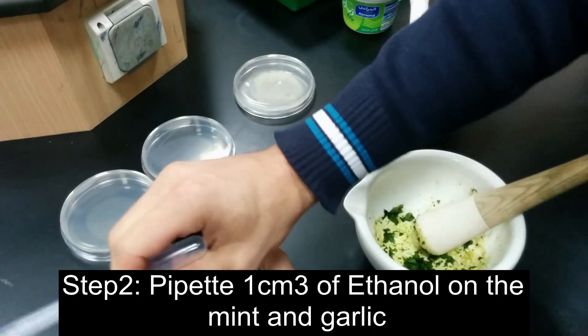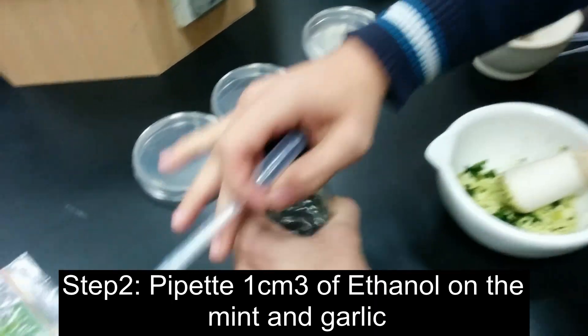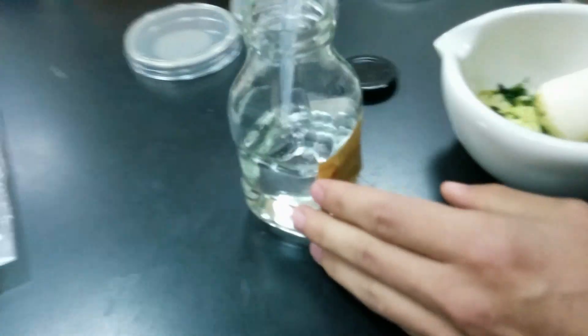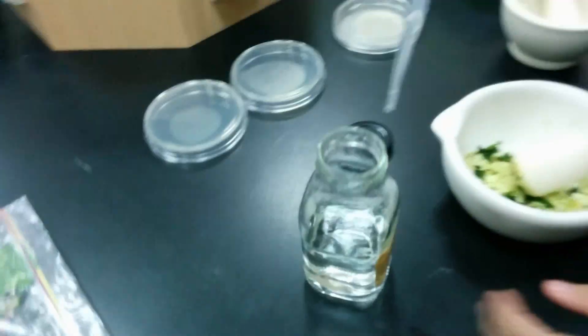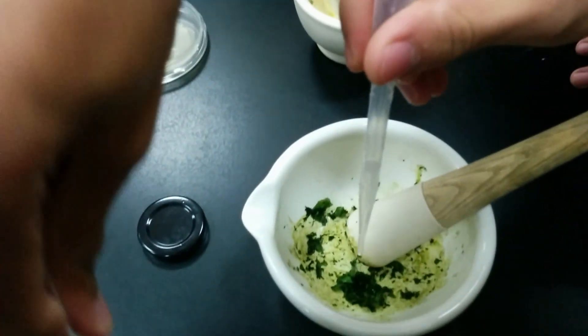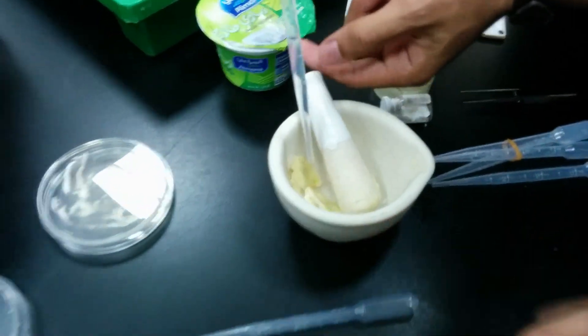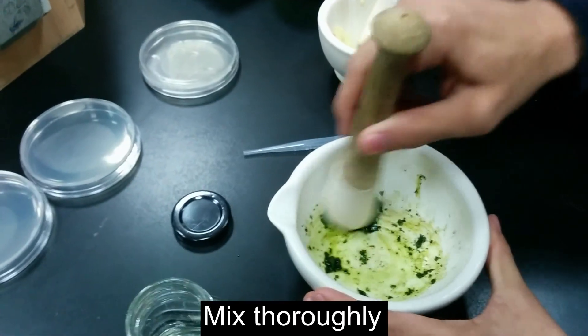Now we have to add one pipette of ethanol to the crushed mint leaves. Then we have to mix it again.